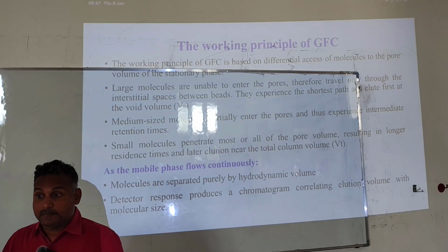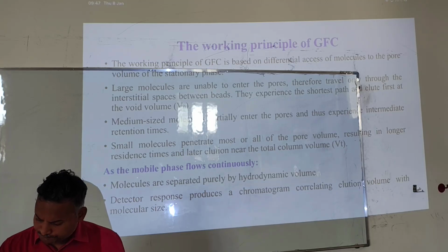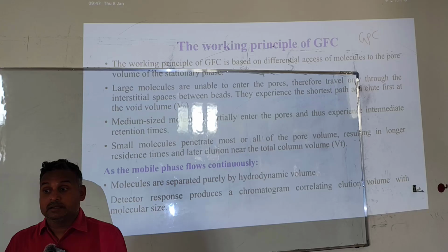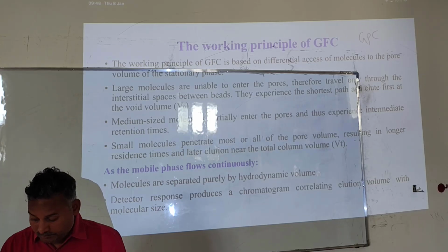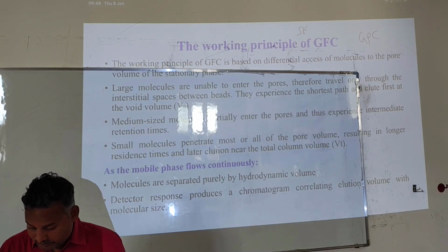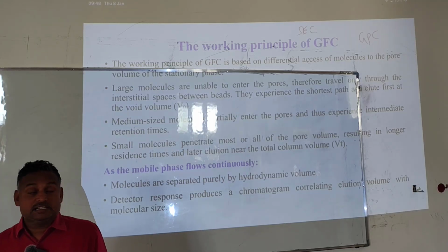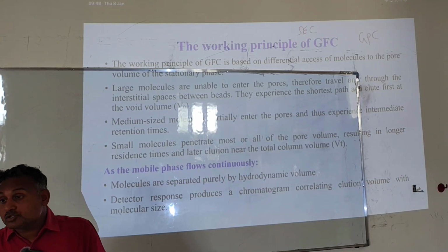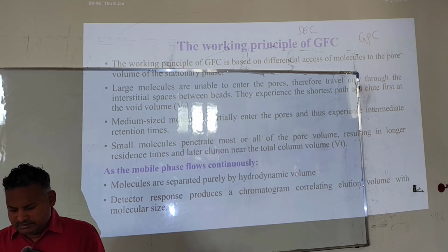We can also say GPC, gel permeation chromatography. We have also another name, SEC. SEC means size exclusion chromatography. All these names are the same chromatography.